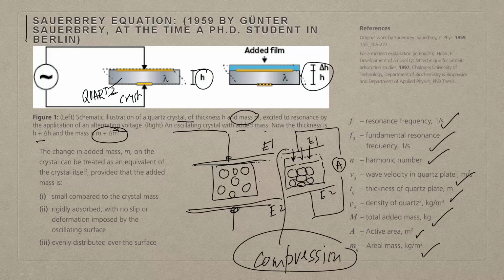So, you can physically compress the material, it will generate electricity as I showed you in this cartoon, where you have the molecules arranged like this before compression. After compression, they are close by and they generate electricity. You can achieve exactly the same thing in a reverse way. You can apply current across it and they will reach that particular deformity.